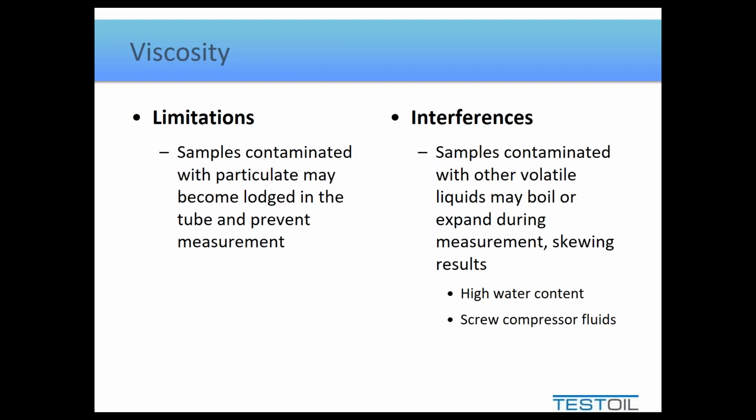There are those that like to see the oil degassed so they can confirm that the oil without the gas has nothing going on with it and it's just a gas issue. Others like to see it with the gas in it because they go, well, that is how it is circulating and lubricating. Both offer reasonably practical answers to which one's better. I've always been of the opinion that it's better to see it as is than it is to doctor the sample in any way.